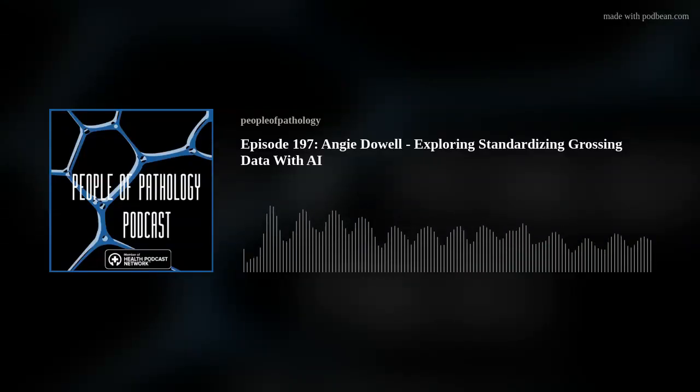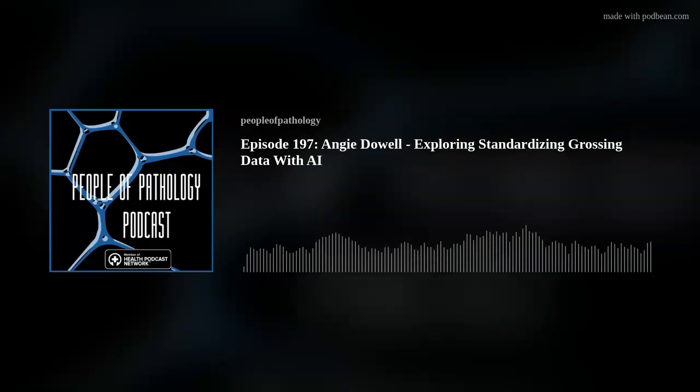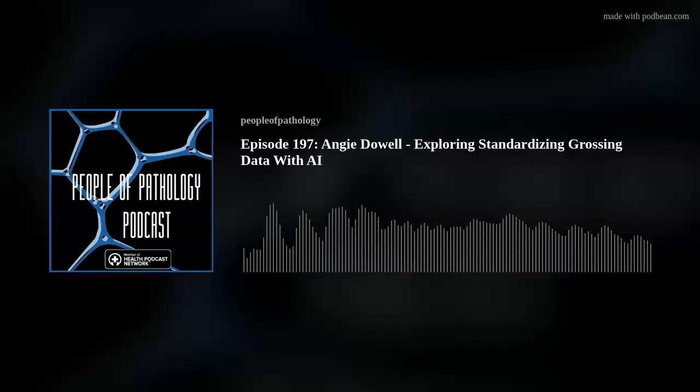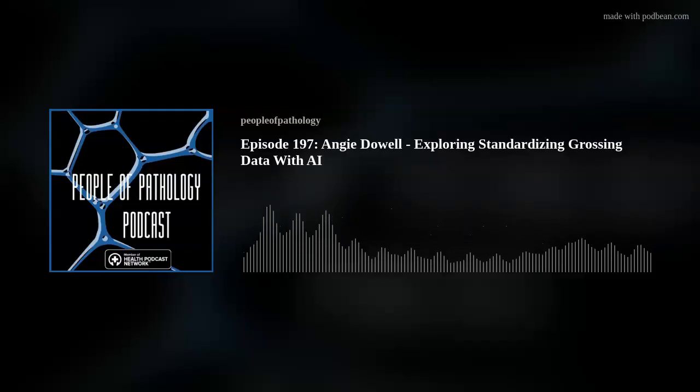I reach out to a lot of PAs. I mostly do education and just kind of talk and listen to other people's perspectives, try to understand what their fears are, and then talk through how AI is augmented grossing and here to assist the grosser. If you had to name one aspect that you find most rewarding about this position, what do you think that would be?